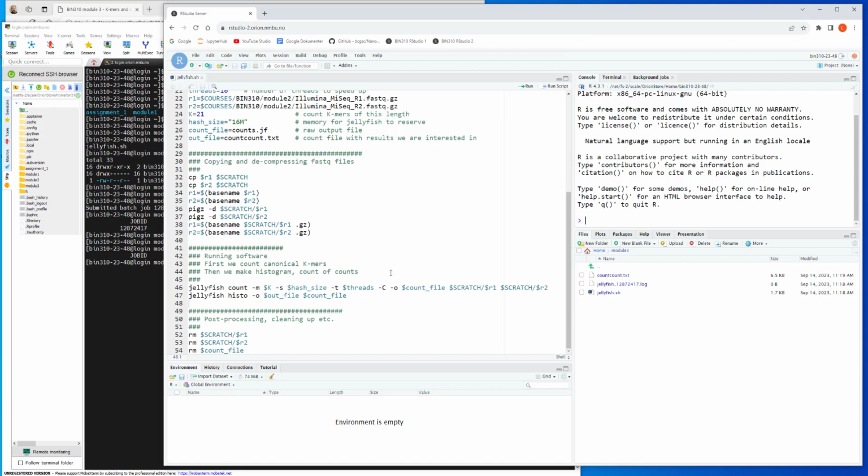So hopefully this ended successfully. You can actually click open the log file, but I can see already it's empty, which is usually a good sign. Some software will output some text to this log file, some don't. But if it's empty, it's a good sign, because if there were errors, they would also be found in this log file. Okay, so possibly this one is now, let me click it open.